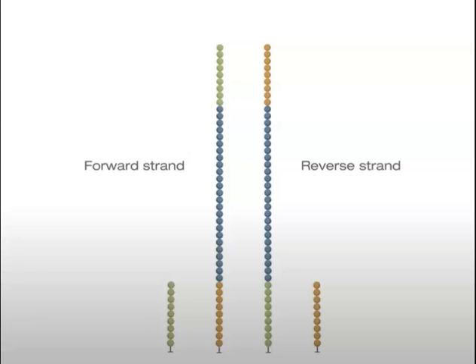So after denaturing that step, we end up with a forward strand and reverse strand, both of which are chemically attached to the oligos that formed part of that initial oligo lawn, so these are now permanently attached to the flow cell.